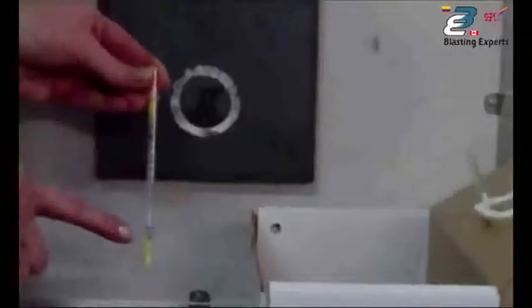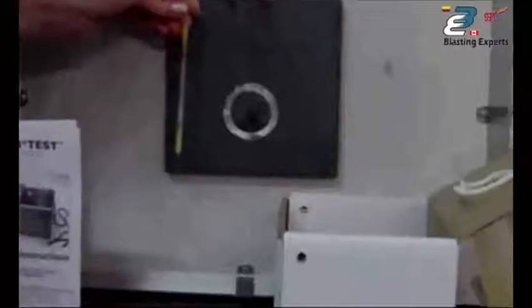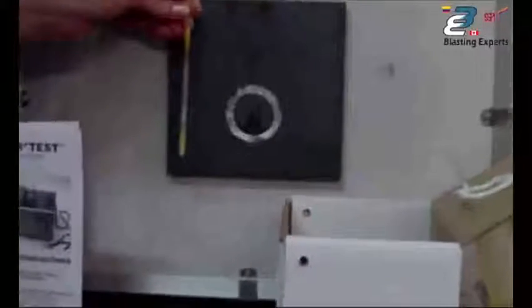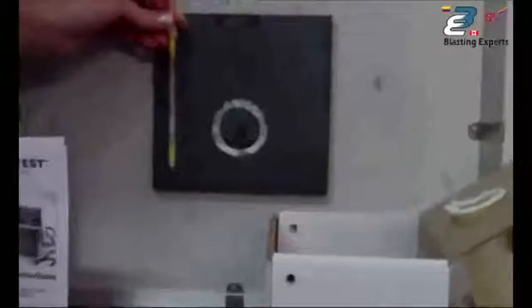There's a tube right there that you can see the amber color at the bottom, and the chloride makes the pink in the tube turn white. So what you're looking for is the top of the white to pink transition. At the highest level of white is what the reading is for chlorides. The tube measures in parts per million, and we have engineered the test kit so the parts per million is a one-to-one ratio to micrograms per square centimeter. We've pre-done all the math. There's no calculation to do.